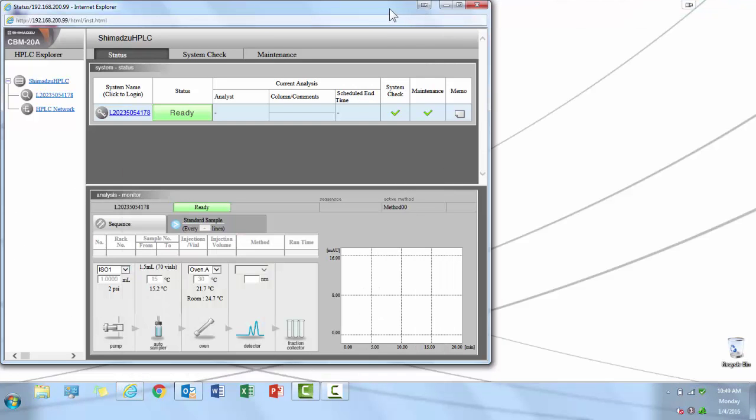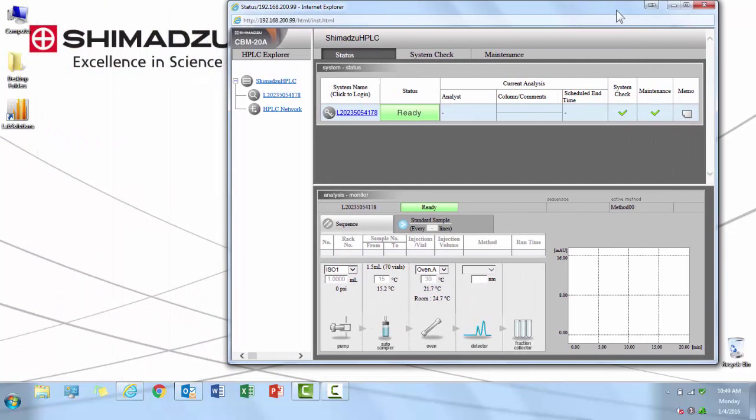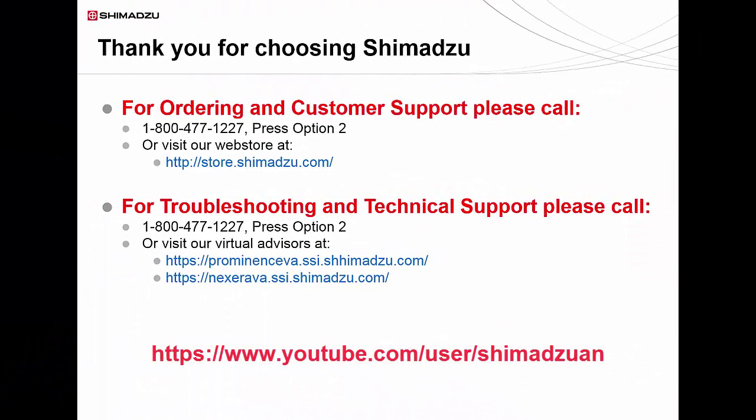If you are still unable to see the CBM's web interface, you may need to turn off Pop-up Blocker on Internet Explorer. To learn more about the CBM's web interface and its diagnostic functionality, along with other how-to videos, please see our YouTube channel.